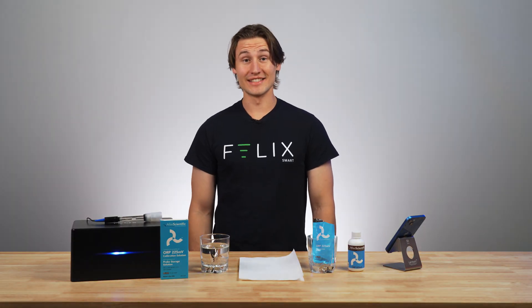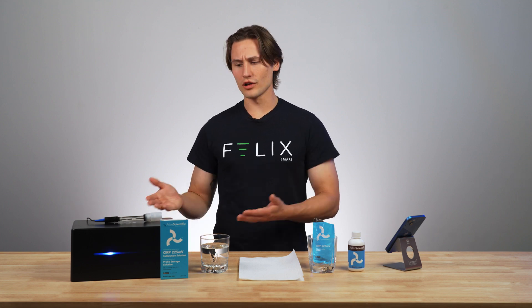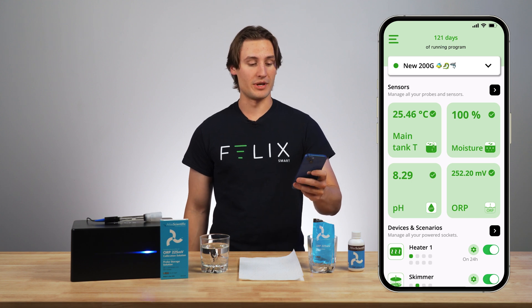Welcome back to the FelixSmart Studio. Today I'm going to be showing you how to recalibrate an ORP probe. Now all of your probes already come pre-calibrated, but there may come a time when you have to recalibrate your probe. So the first thing I'm going to do is pick up my application and go into the ORP probe.